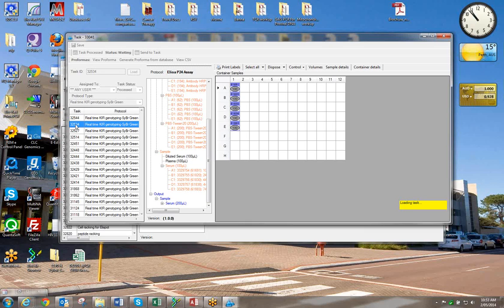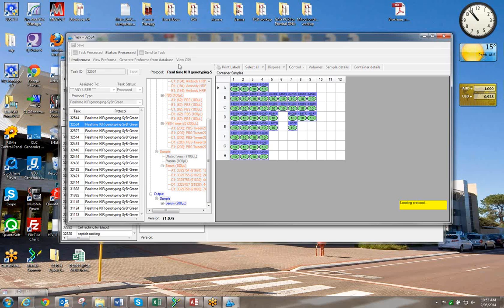Yeah, it takes ages like this, it spoils the whole show. Shouldn't take this long. Obviously, again, I'm choosing the wrong one.